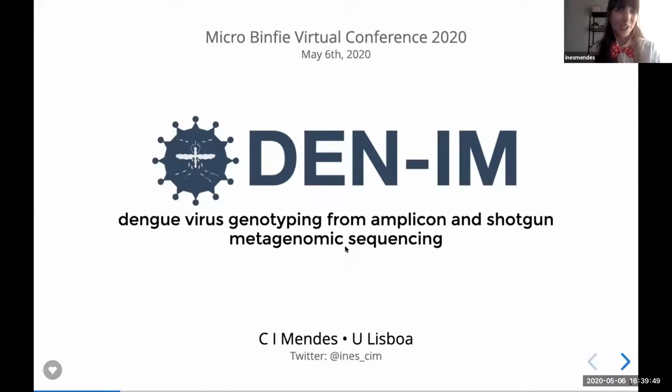So I'm presenting you a work that has been recently published about dengue virus, specifically identifying the genotypes of the dengue virus in amplicon or metagenomic sequencing samples. This work was a collaboration with the University of Groningen, for which Professor John Rossen is here.